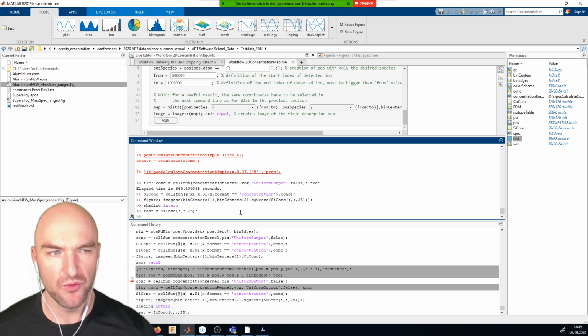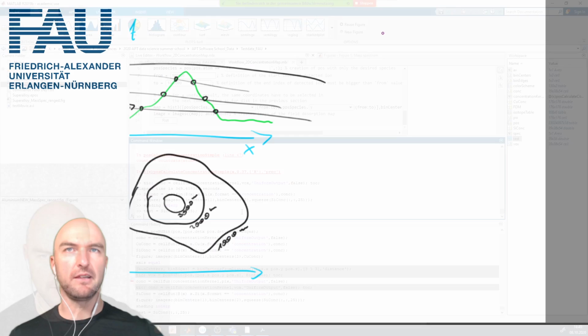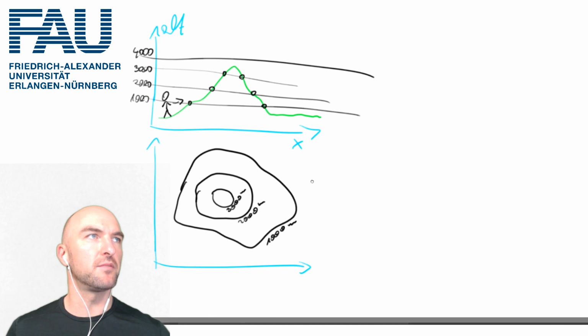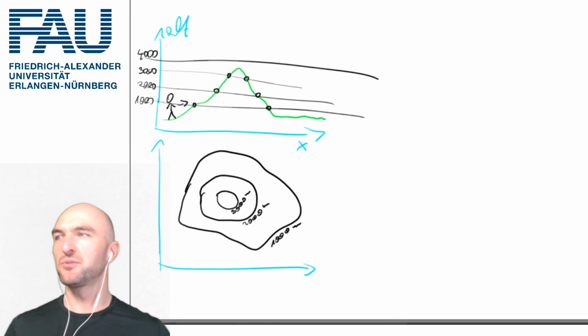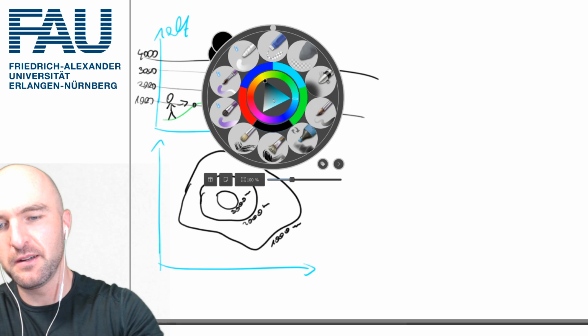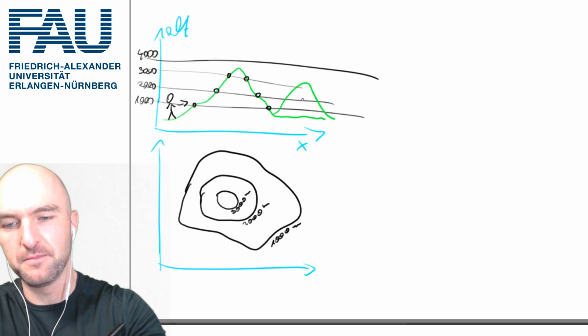Usually what we want to do first, if we calculate an isosurface, and let me go back to the tablet drawing. Oh, you weren't able to see some of my beautiful drawing here, is to see if we might have multiple hills.